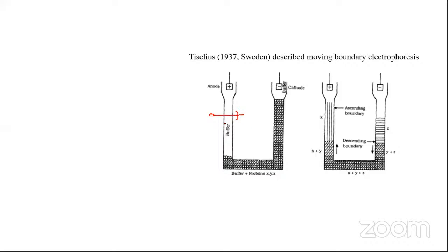Now as soon as this portion starts to get crowded with X molecules during electrophoresis, the detector's ability to detect the laser is slightly altered.